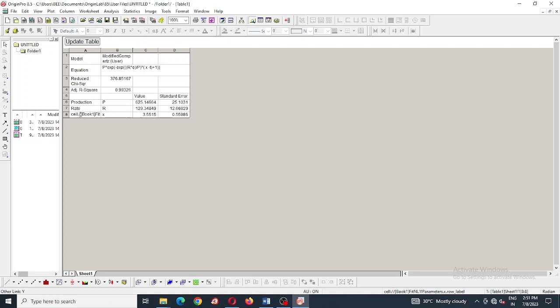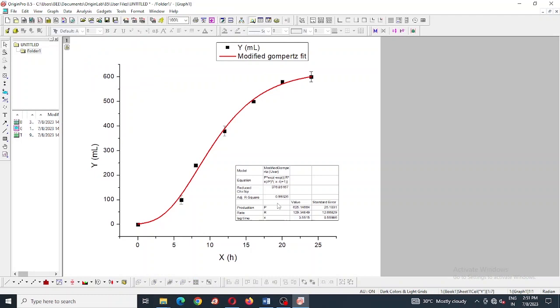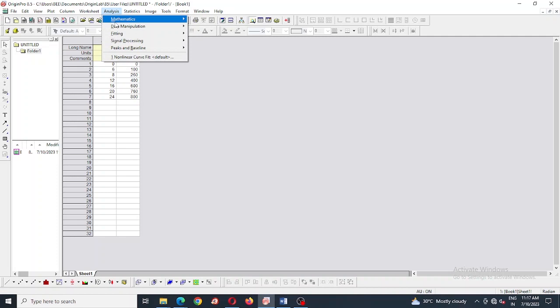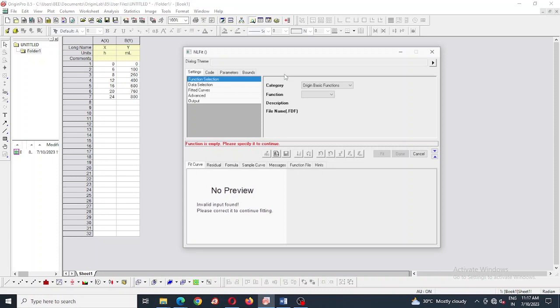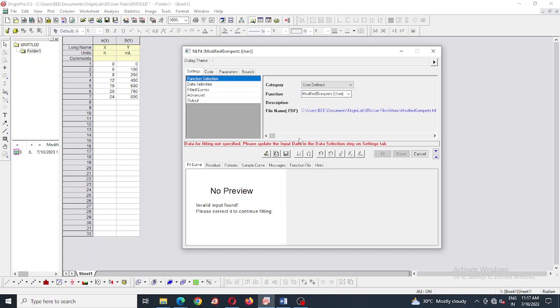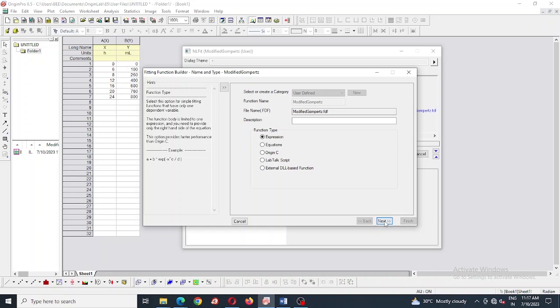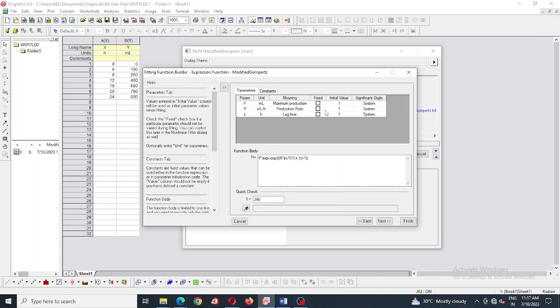Now we are going to edit the modified Gompertz equation and use it for curve fitting with these data. First going to analysis, then fitting, then nonlinear curve fit. We have selected user defined modified Gompertz equation and click the edit fitting function tab. Next check for any editing, here I have added unit and meanings.